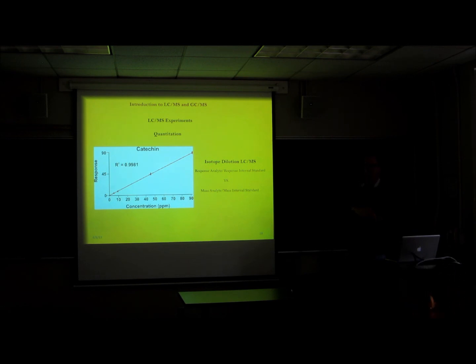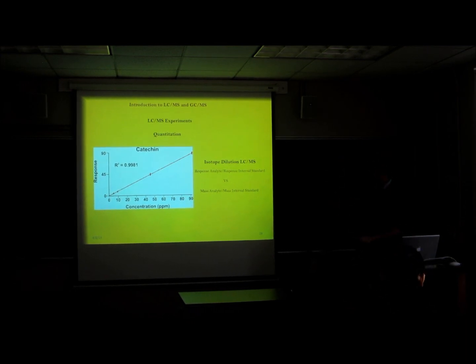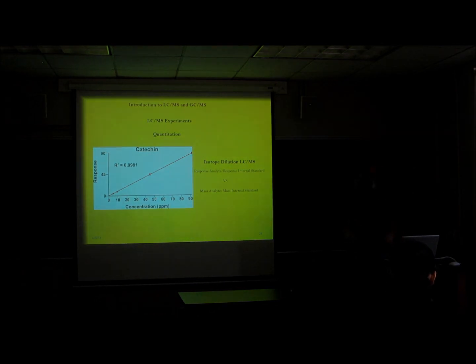There's a lot of really special considerations one needs to make when you're doing LCMS quantitation, and we'll talk about those, some of the challenges and some of the things you need to do to be able to do it accurately. Any questions? Otherwise, you can send questions or anything else to me, my email in your 1-minute paper.